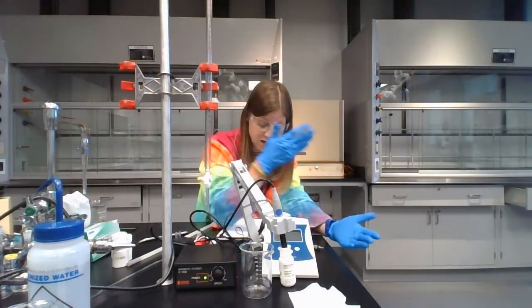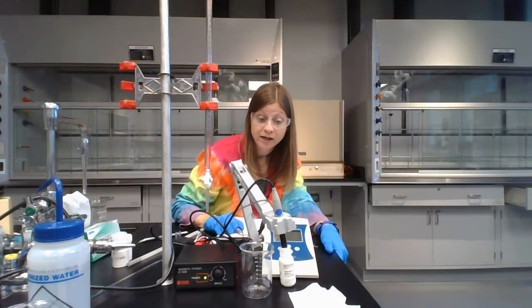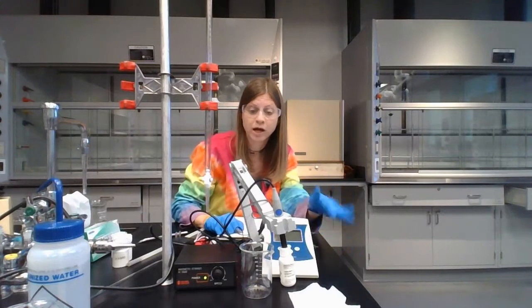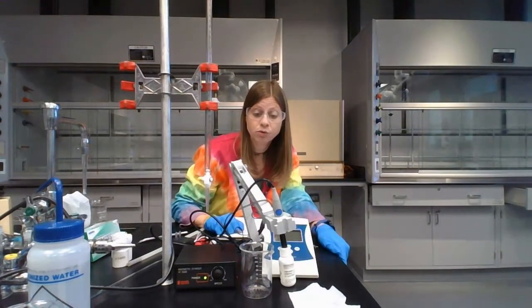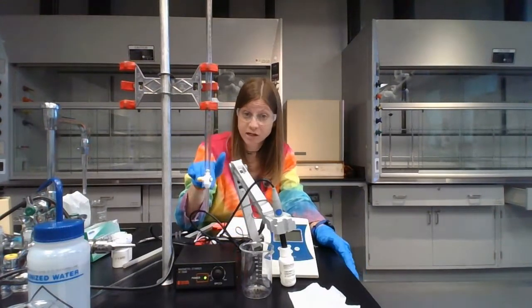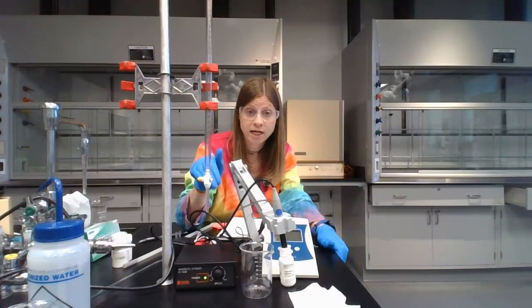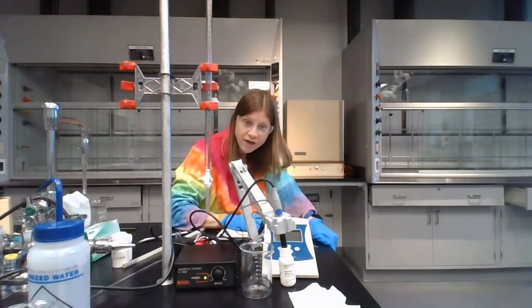And then at the end of trial 3, you've collected all of your data. At that point, we're ready to clean up. So you will need to rinse off your pH probe, put it back in potassium chloride. You will return your stir bar to your instructor where you checked it out. You will put away everything. The burette needs to be drained completely, so that way the sodium hydroxide is out of it, and then the burette will be placed in the labeled designated container for that.